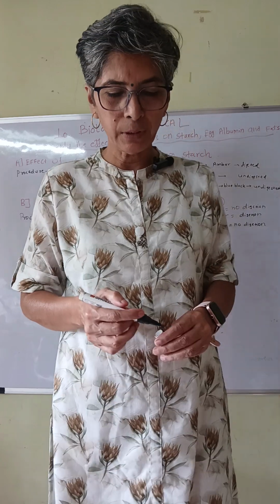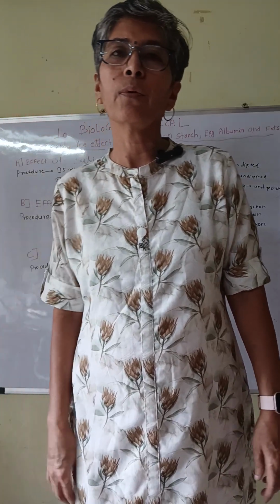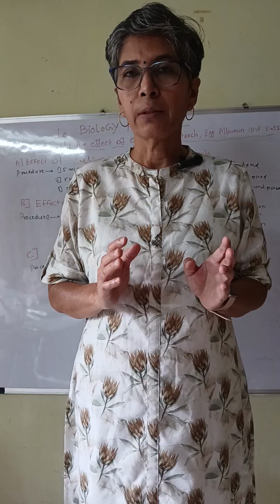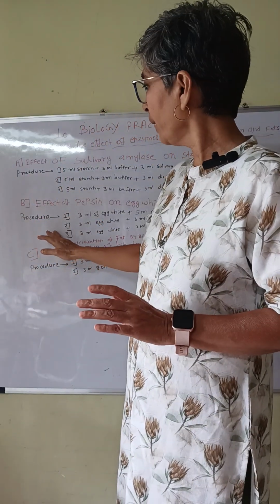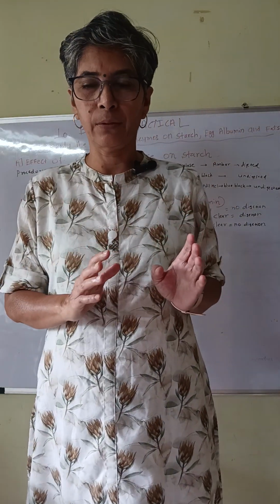Pepsin is an enzyme which is used for breaking proteins into peptides. This is the main principle for the activity of the effect of pepsin on egg white.